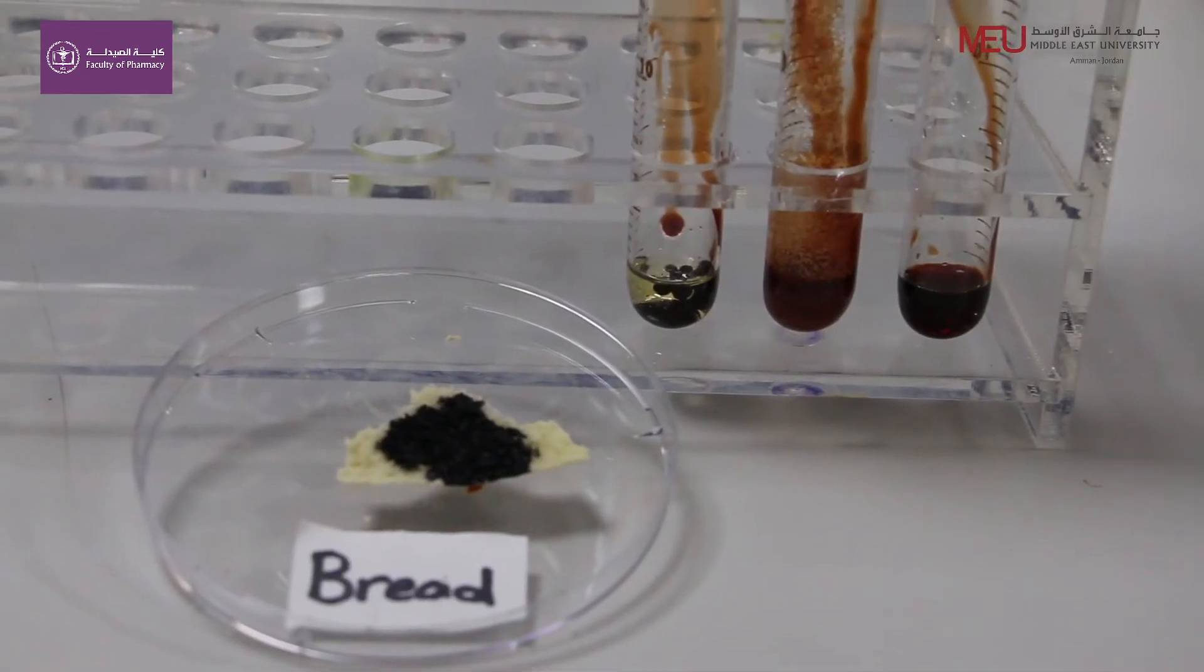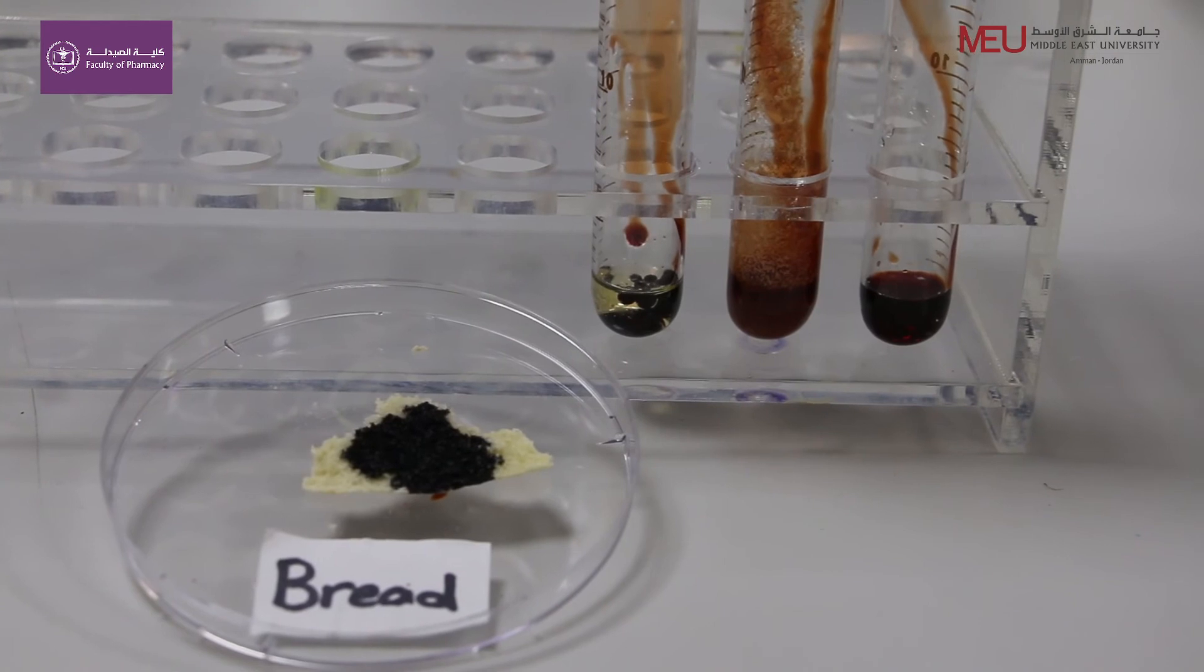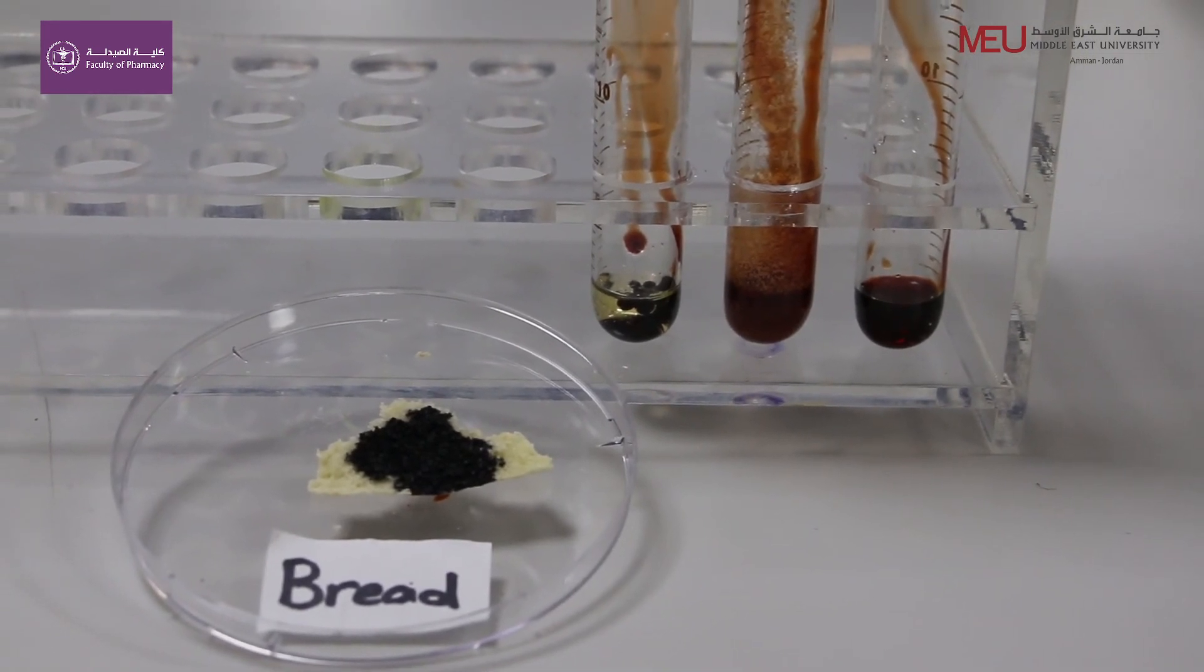When starch is present, a black-blue color appears.